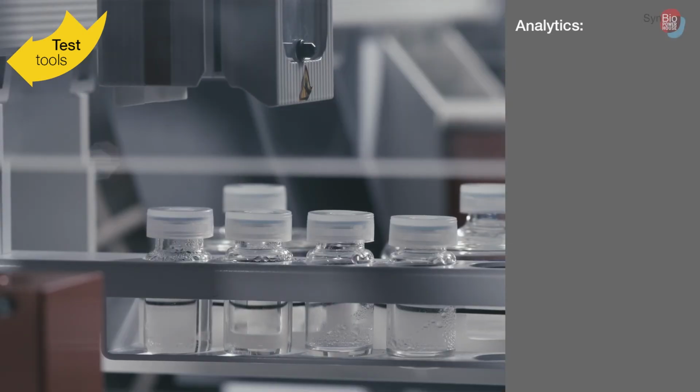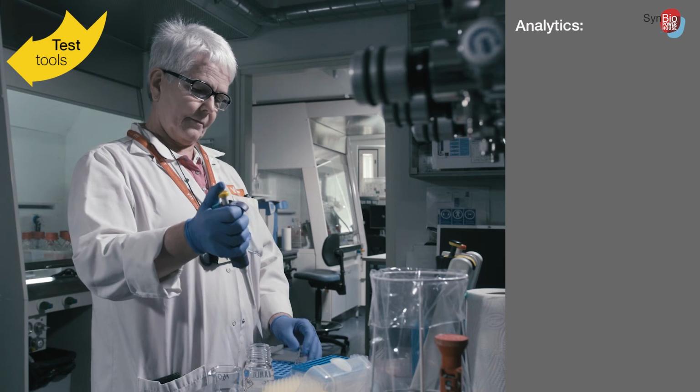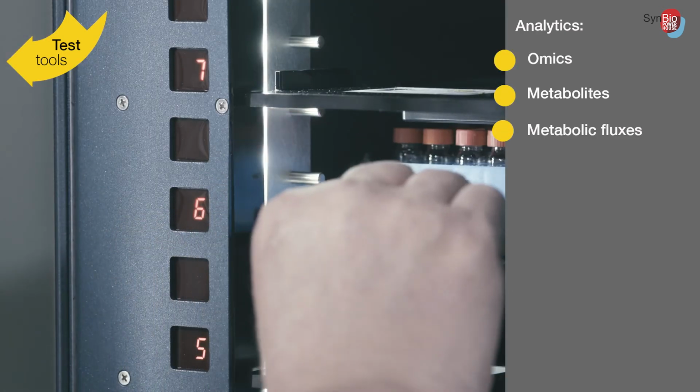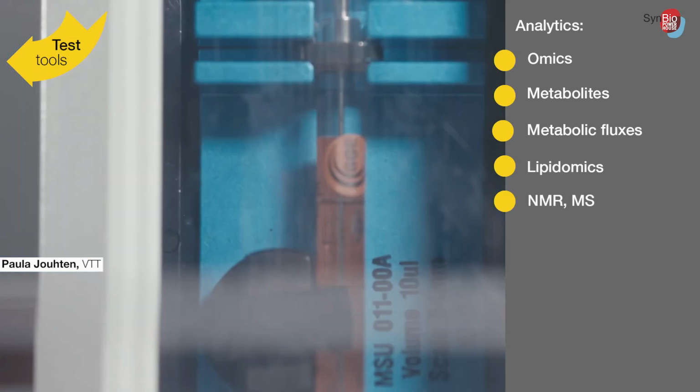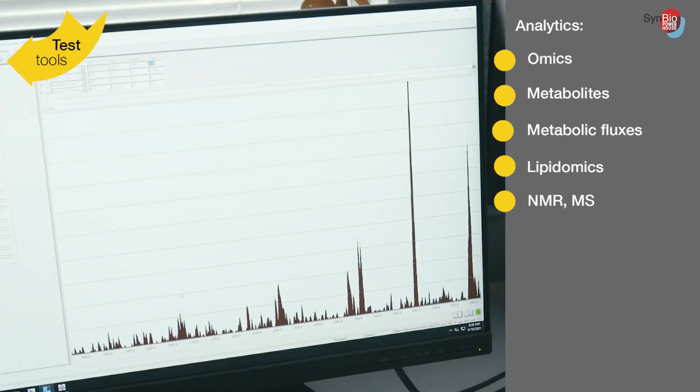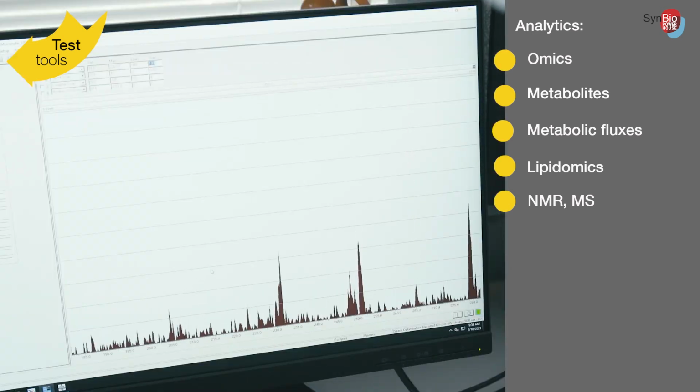The analytics team at VTT have decades of solid experience and can carry out a multitude of measurements. We have the bioanalytics and small molecular analytics in the team. So we can do fast measurements, we can do extensive measurements, we can do targeted analytics that are suited for certain applications. We develop novel methods there.